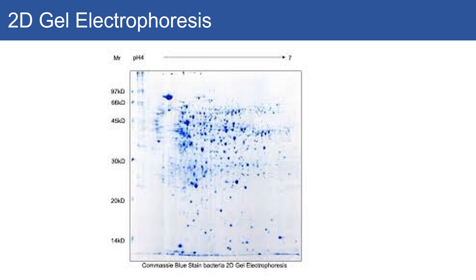Well, this gives you one way of distinguishing, as well as the others, which are your Western blots, which are highly specific. What you'd commonly do from this is you wouldn't know what protein. You'd run this in a situation where you didn't know your protein. If you're running a Western, you know exactly what protein you have, and you're trying to be very specific to the antibody.